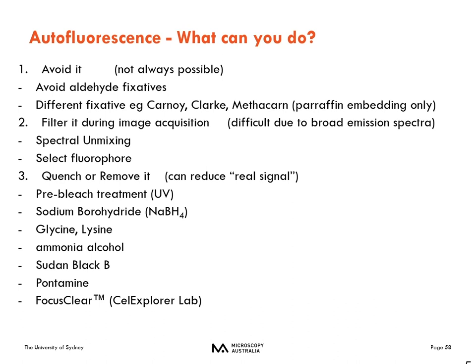And another method, we can try to quench or remove it, but it may end up reducing the real signal. Different papers have published methods to quench autofluorescence, including using UV, sodium borohydride, lysine or glycine, or Sudan Black and ethanol, and other solutions.